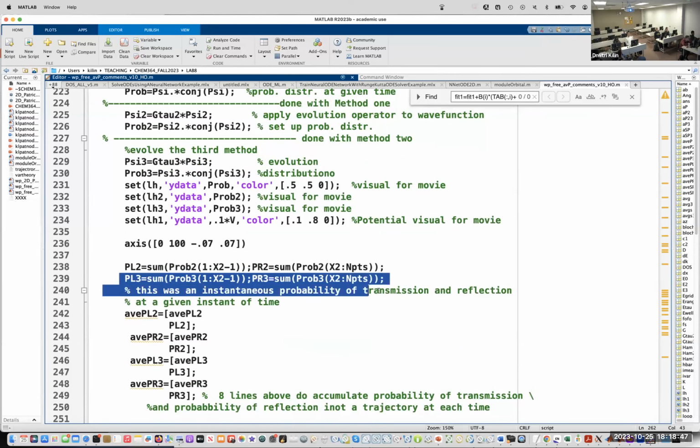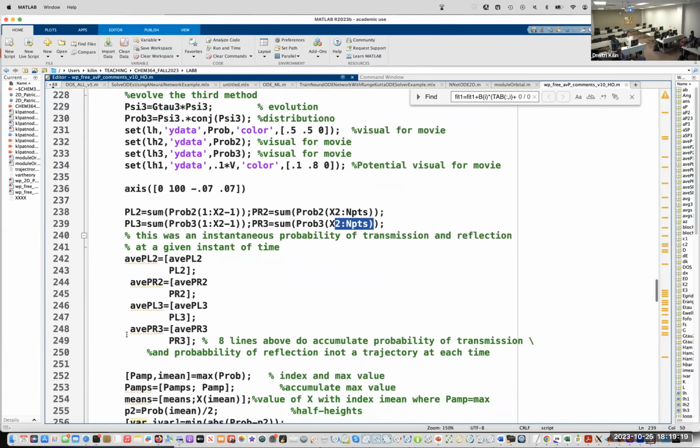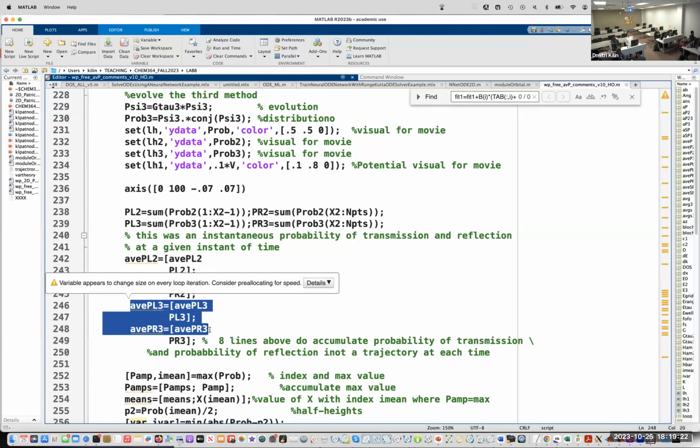And there is a set of variables that is pre-made to describe the yield of chemical reactions. So this PL and PR is the probability to the left, probability to the right. X2 is the midpoint of the x-axis, and one just adds together everything from the beginning to the midpoint, and then everything from the midpoint to the end, and then one does this average PL3, average left and right.